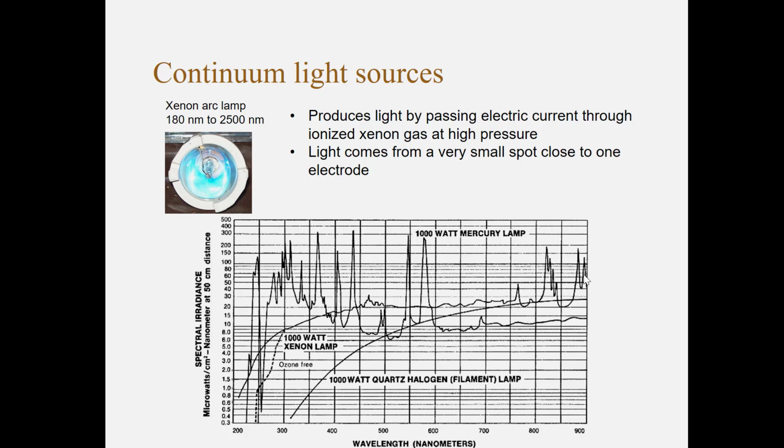And that's good for some applications, for example cinema applications. These are often used in cinema, and another reason they are used in cinema is because they can produce so much light. They can be up to 15 kilowatts, for example, if you look in an IMAX cinema projector. So just to quickly recap, we have two different sources of emission.